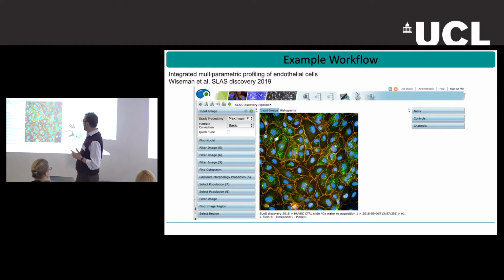We use the nuclei for identifying the cells, as Davide has highlighted. And our problem when we started with this was recognizing different junctions. It's quite obvious to me, but I look at this image quite a lot, so I'll try to make it obvious for you.